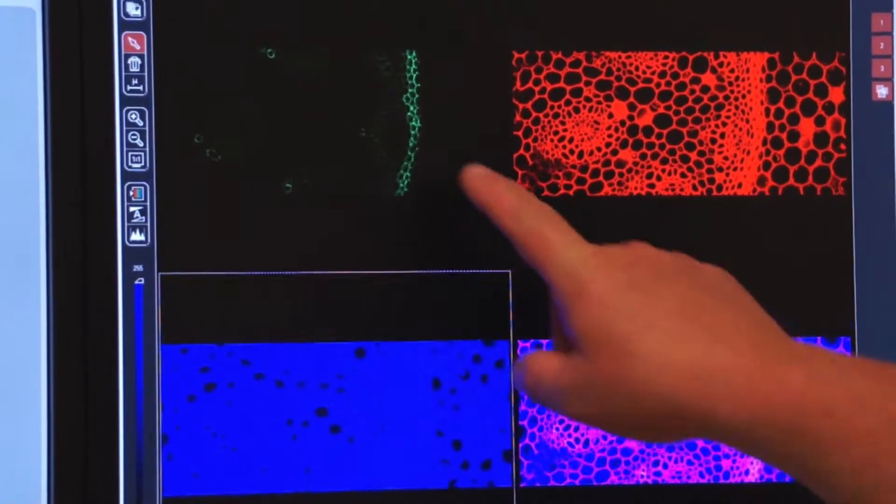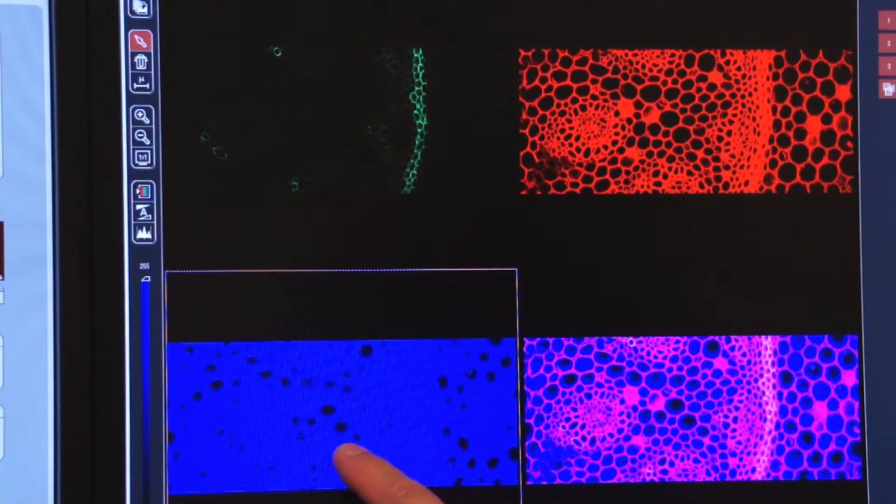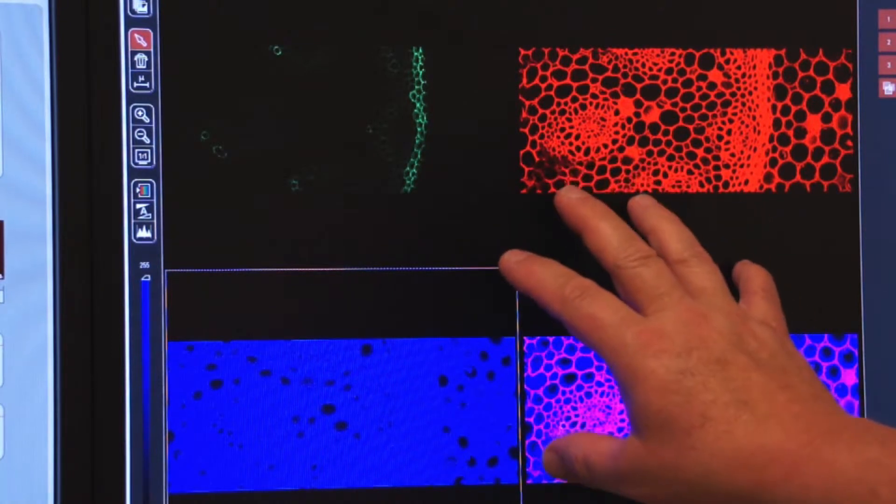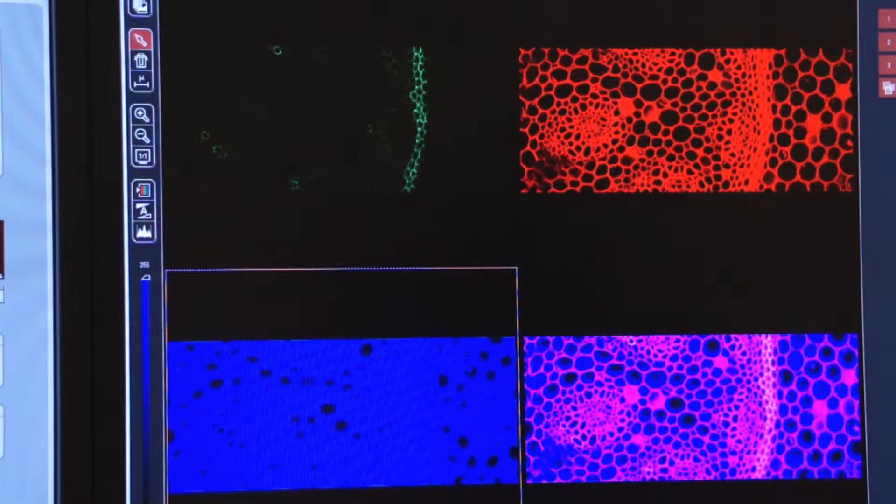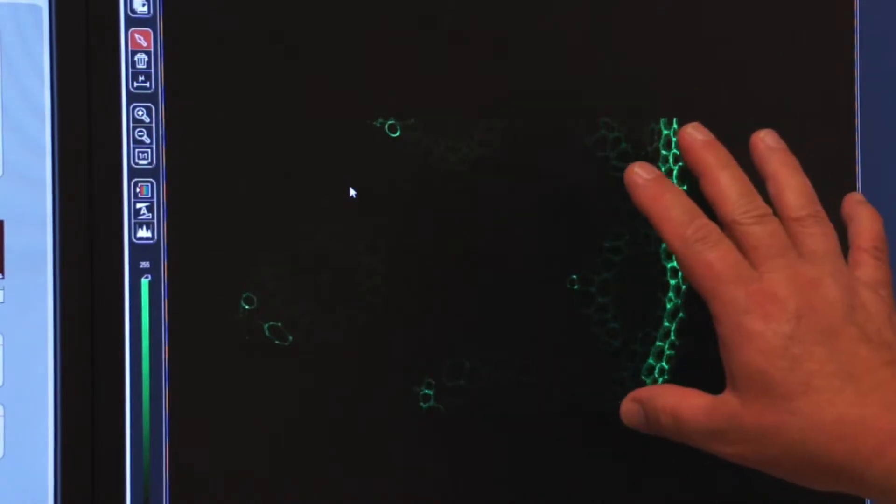The first one is the FITC, the second one is the TRITC, and this is the CY5. Again, we want to set our smart gain and offset for each of these windows. We'll click on the first one. If you double click, only that one comes up, and now we can increase our smart gain.